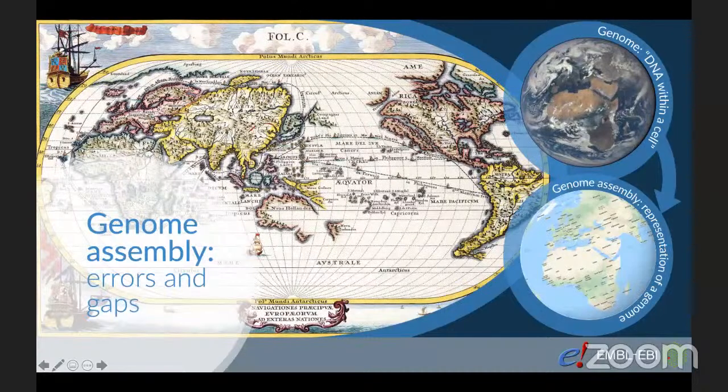So the scientific community closes those gaps, corrects the errors. So the scientific community might issue some patches, which are those little corrections. And for example, here we patch up Australia and New Zealand.